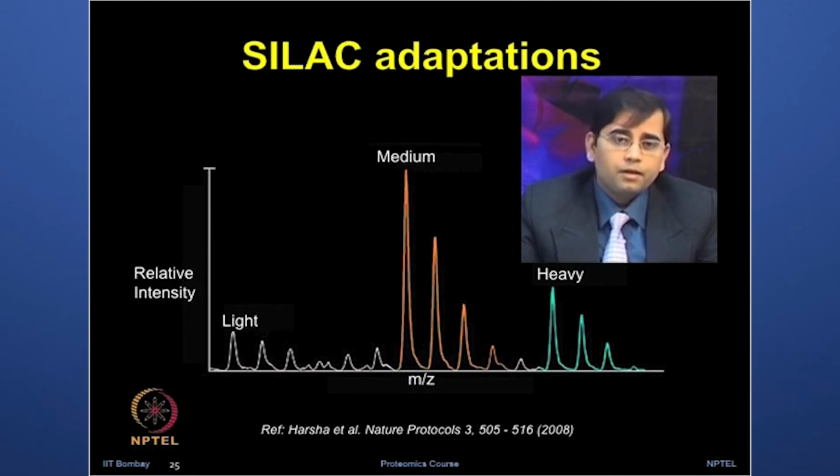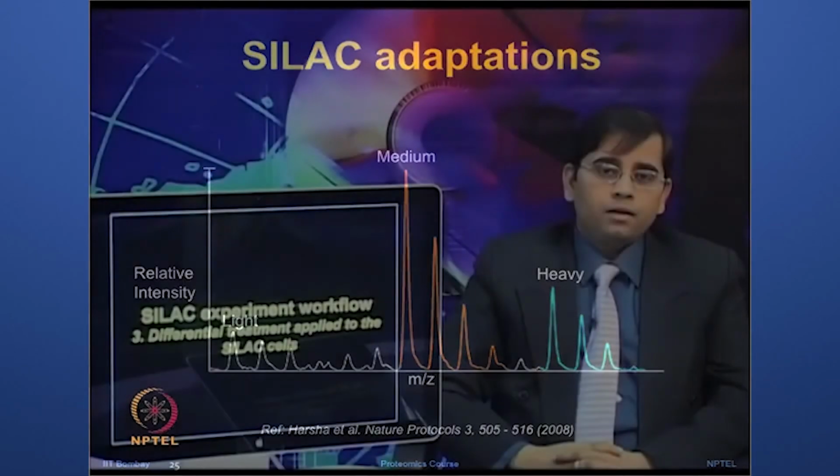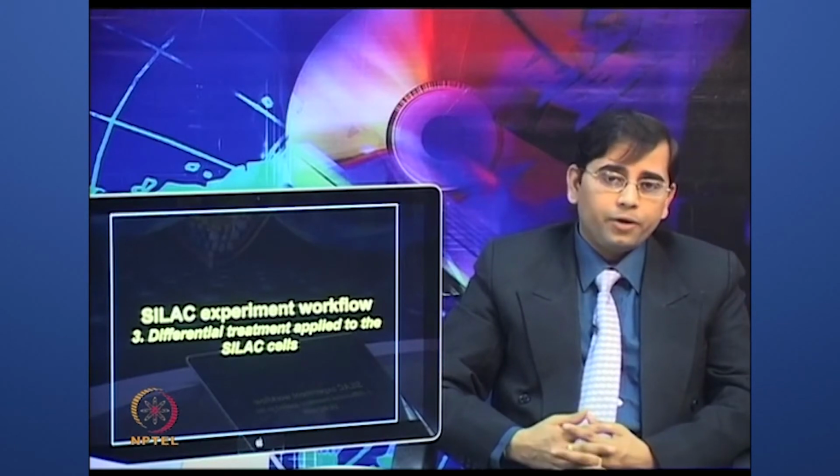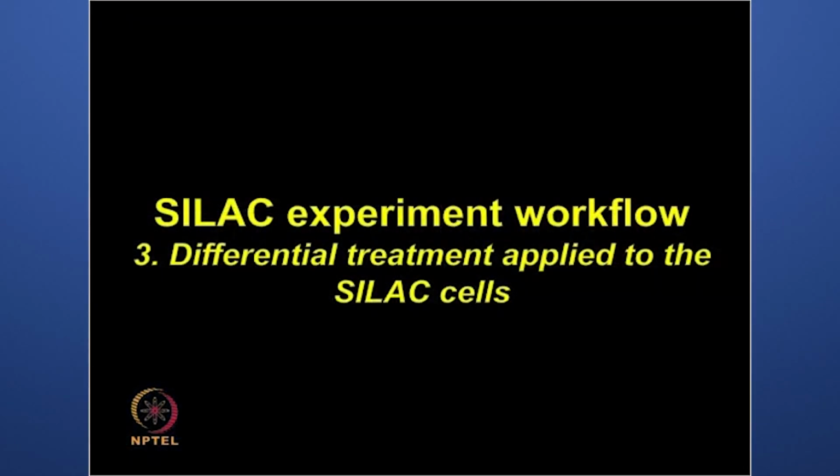These are representative spectra showing m/z ratio and the relative intensity of light, medium and heavy forms. So, in the SILAC experimental workflow, let us discuss the third point, the differential treatment application to the SILAC cells.